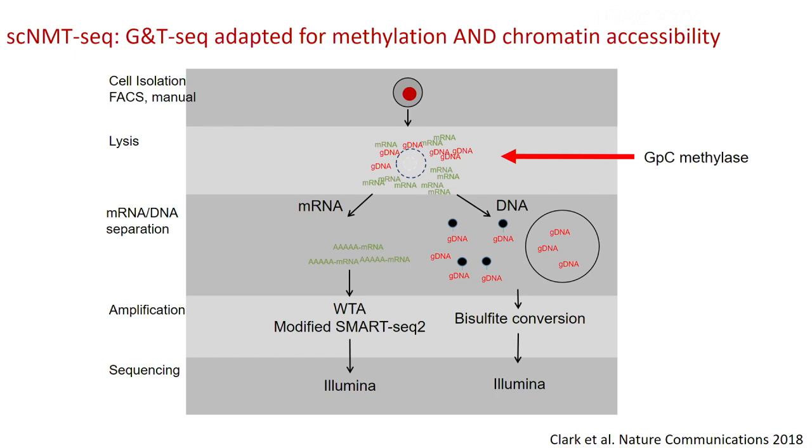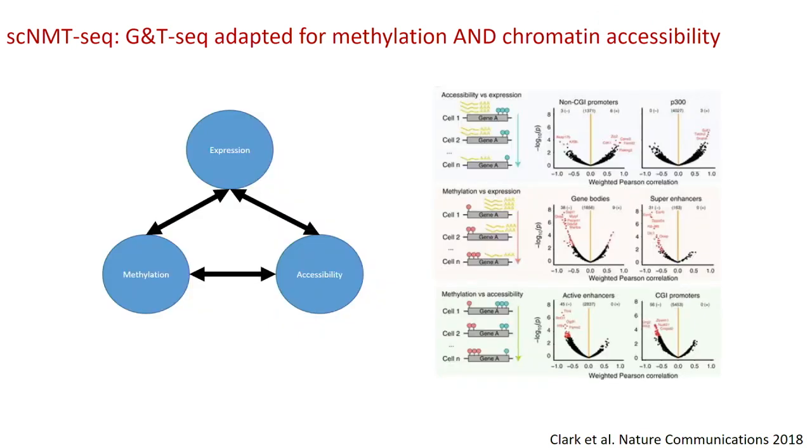And again, this is not a significant change from the overall protocol, at least. The method is reasonably easy to adopt once you have the scM&T-seq protocol up and working. So this is really cool that people are going on developing more aspects to this technology and using the platform to develop pretty exciting new tools, I think. There are some other developments in the works as well, so hopefully it'll continue to develop.